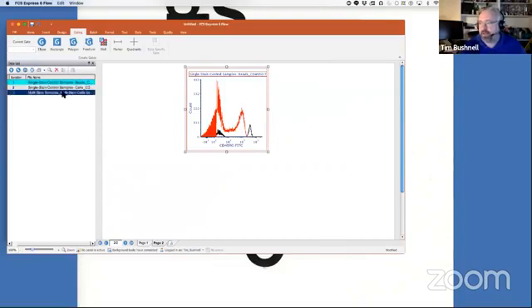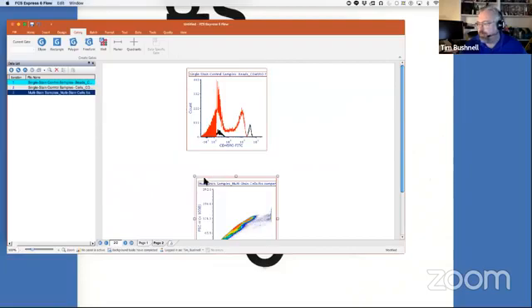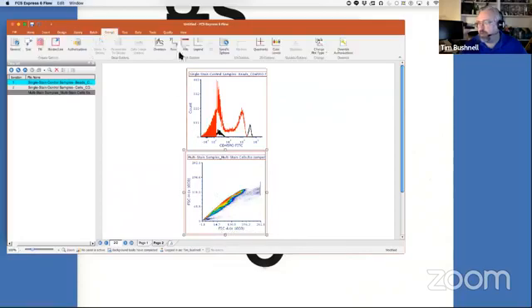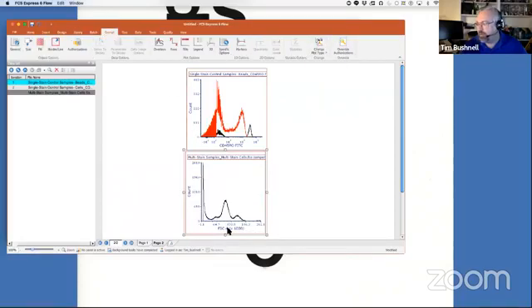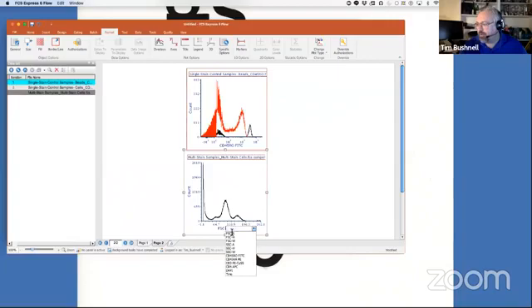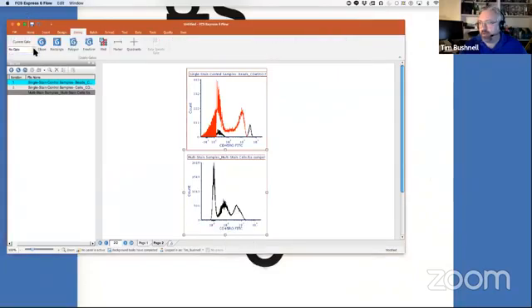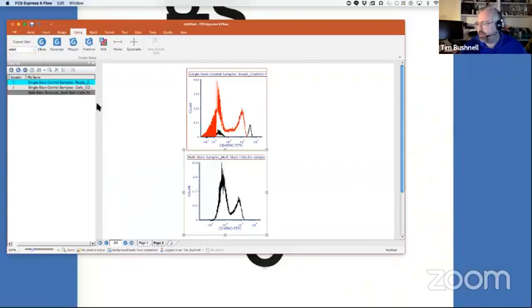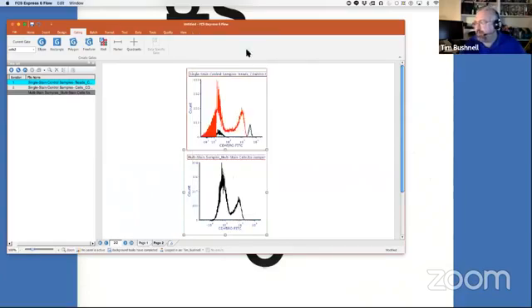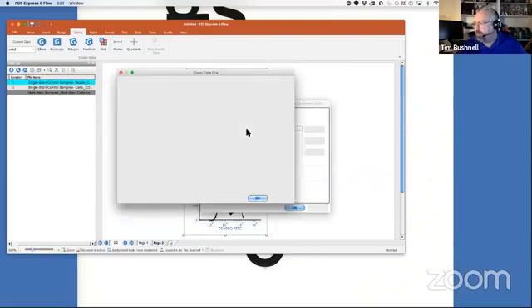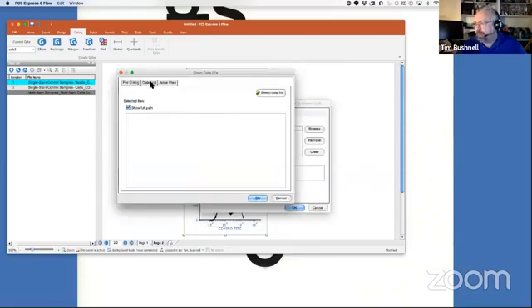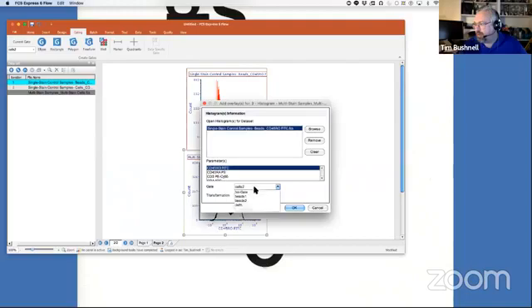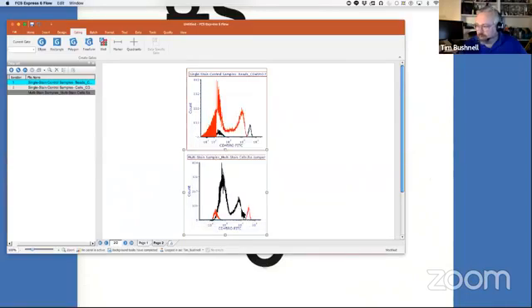And if you want to check that out, here's my multi-stained sample. This has not been compensated, but we'll just turn this into a histogram as well. We'll look at the fluorescein signal, the FITC signal, and we'll put this on our cell gate 2 there. And you can see with our cells that this is about 10 to the 4th. And if we were to overlay our single-stained beads on this, you'll see, again, we're brighter than our controls. We've met that first criteria.